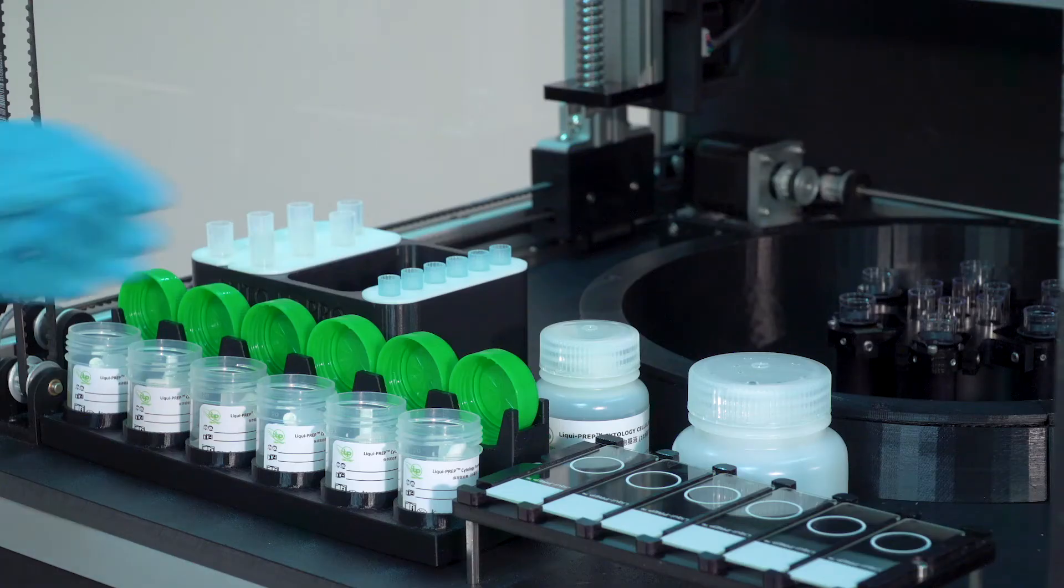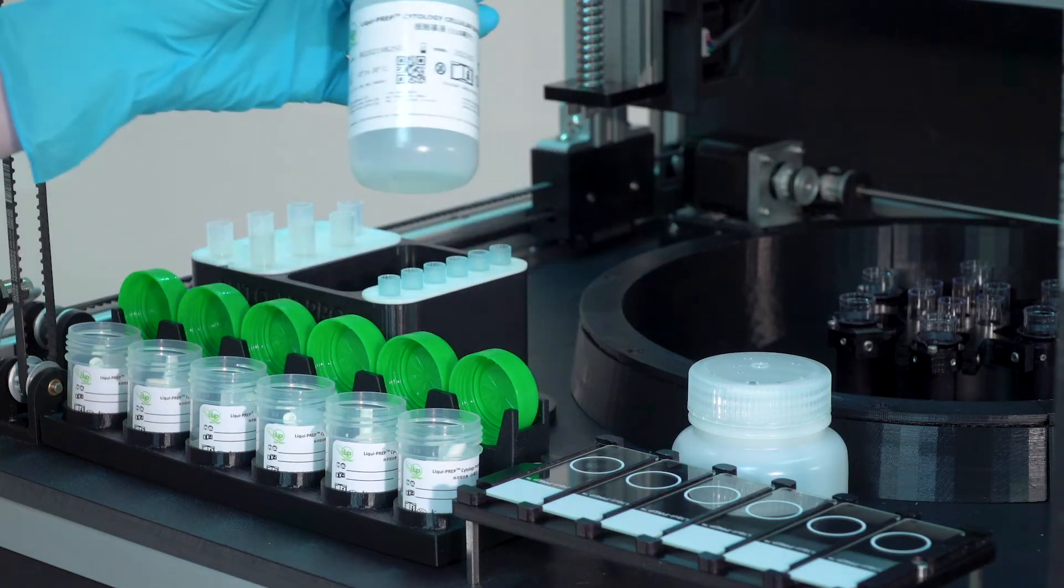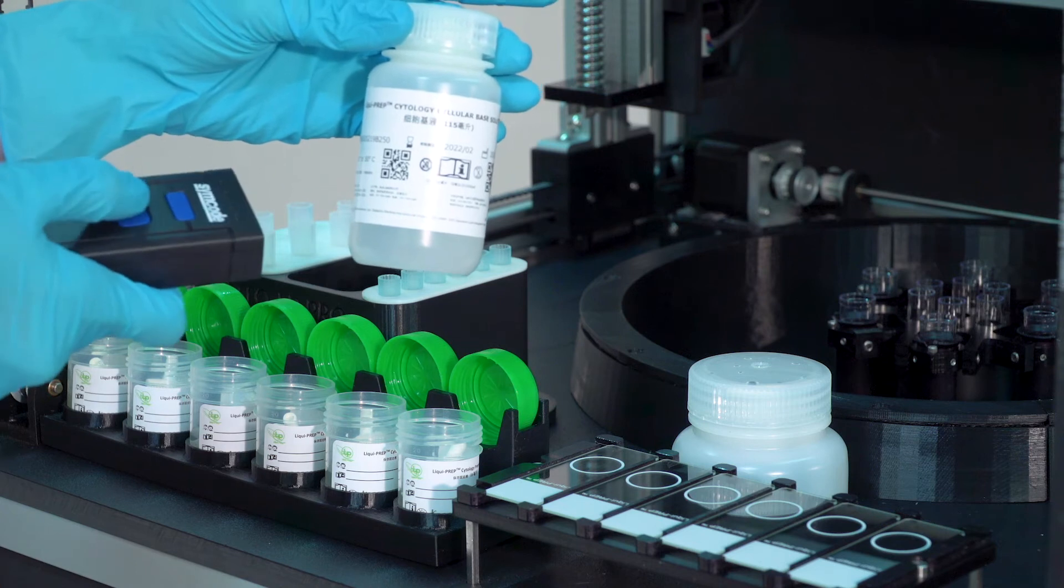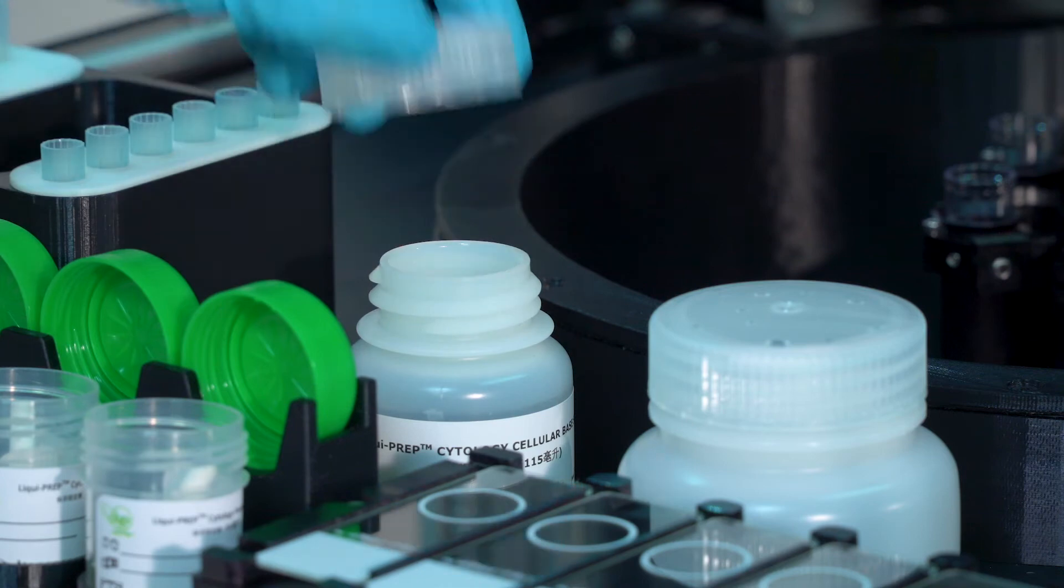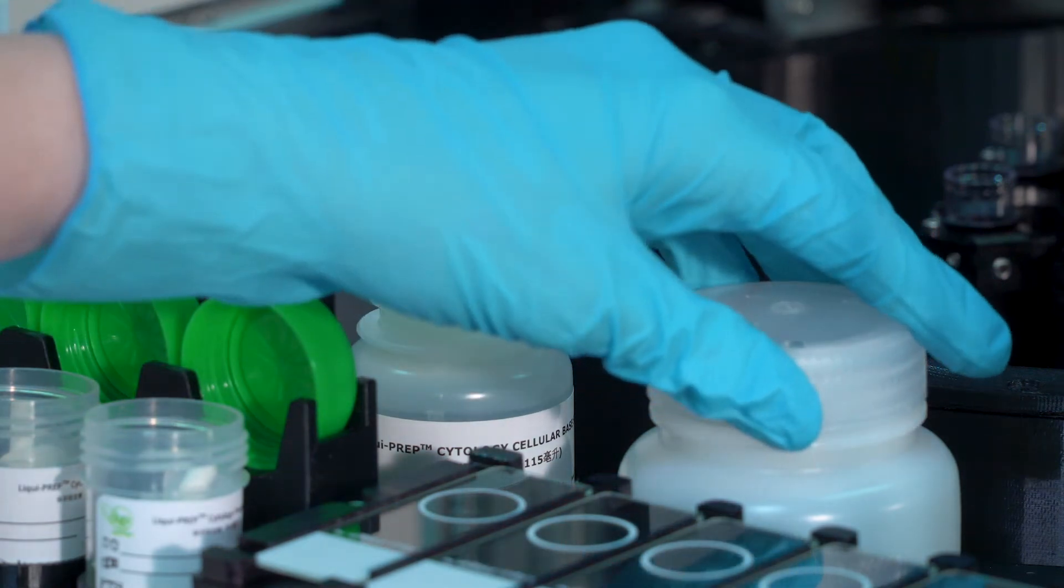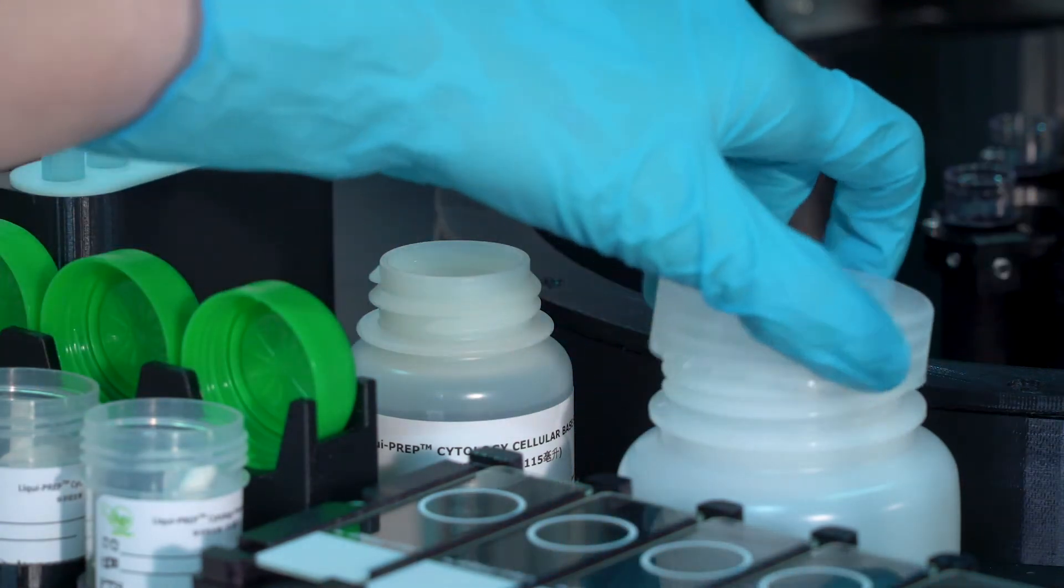Scan both the LIQUIPREP cleaning solution bottle barcode and the LIQUIPREP cellular base solution bottle barcode using the handheld barcode scanner. Remove the caps from the reagent bottles and place both bottles into the AutoLP Pro.